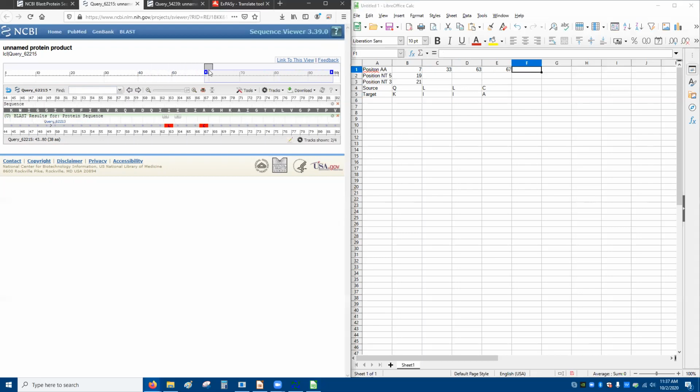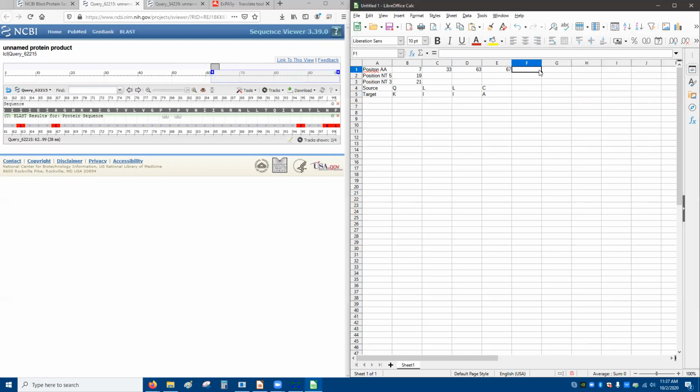Let's see what else we got. I think there's just 3 more. 95, 98, 99. Sure, I think that's right. This is C, this is A, this is K, L. And this is F. And then we'll just copy this.